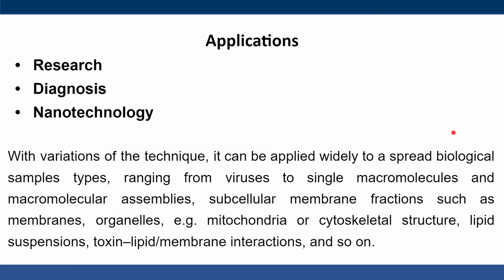Talking about the applications, we can use this technique as a research tool, as a diagnosis tool, and in nanotechnology.